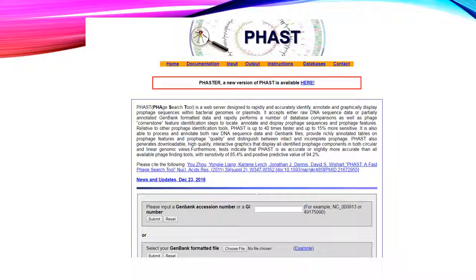To use the PHAST tool, all you need to do is upload your sequence in a GenBank-formatted file into this browser and execute the program. PHAST will identify phage insertion sequences based on specific genes which are derived from phage genomes.